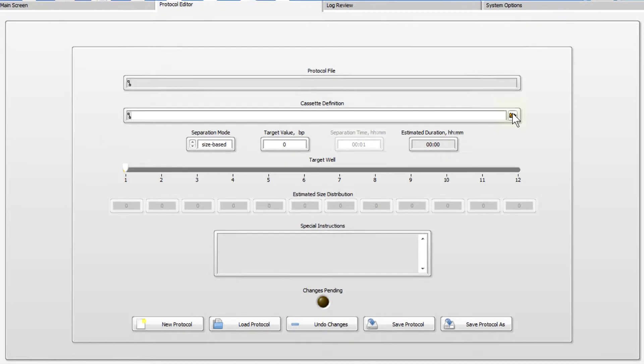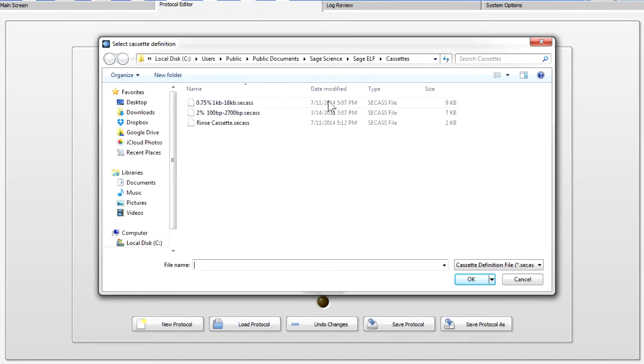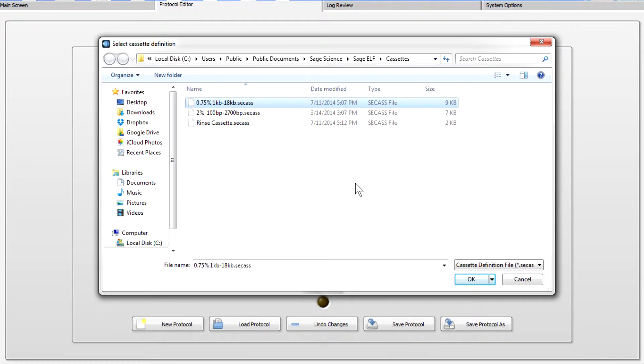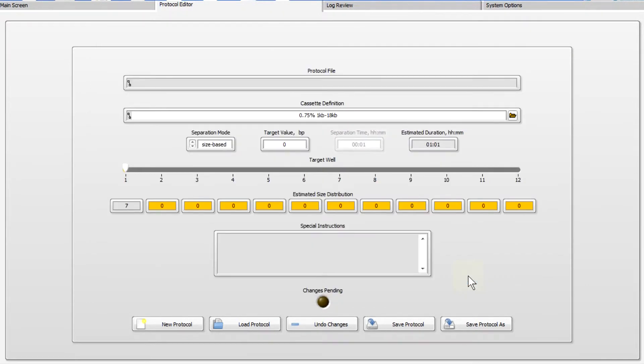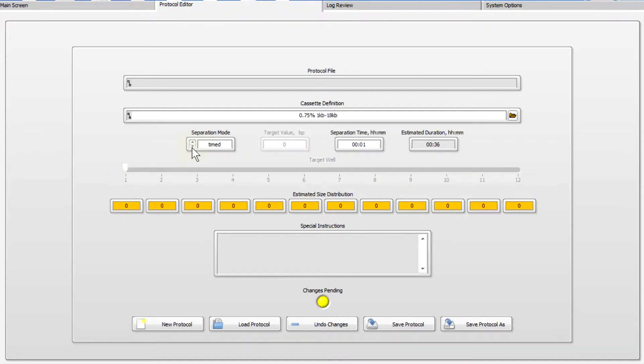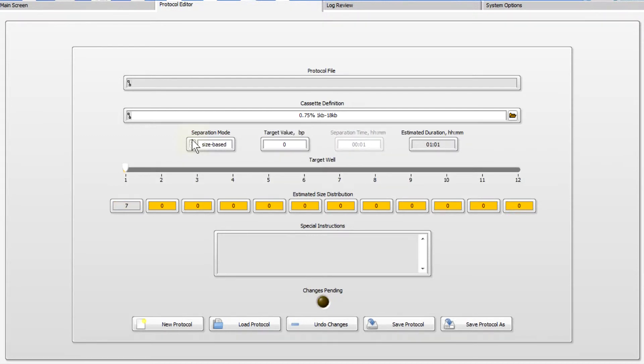If you're running two cassettes at one time, they must use the same cassette definition and fractionation protocol. The separation mode should be set to size-based for running with an internal standard. Time-based mode will produce a more variable result.